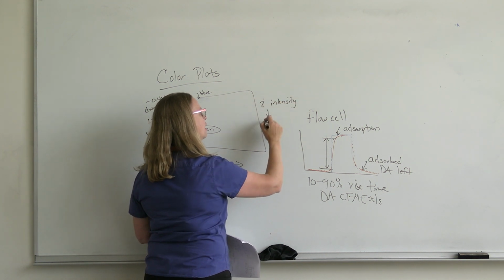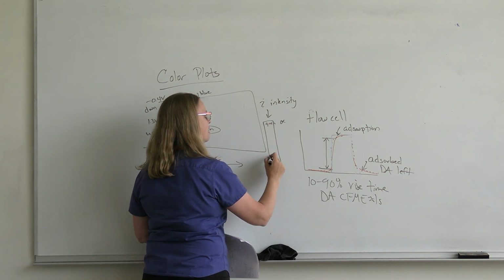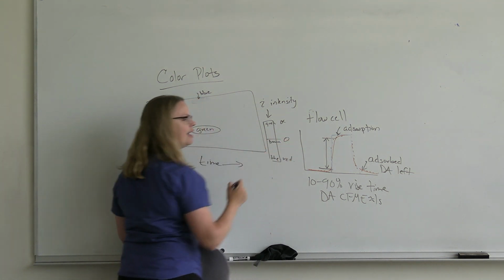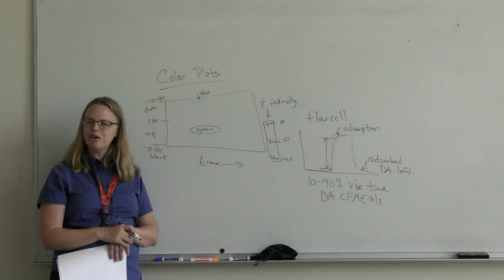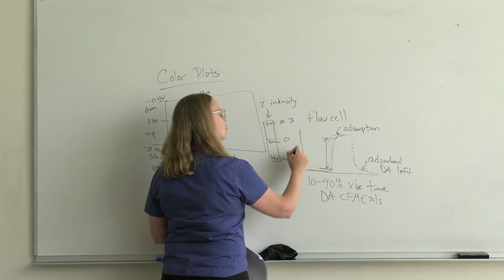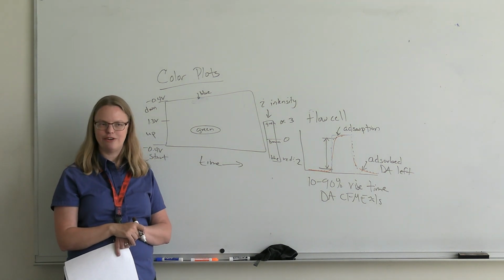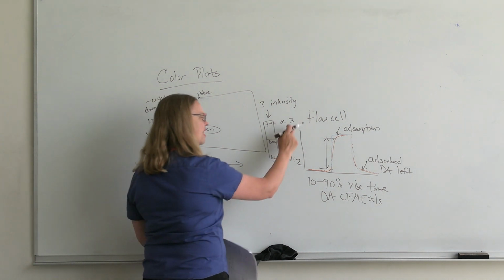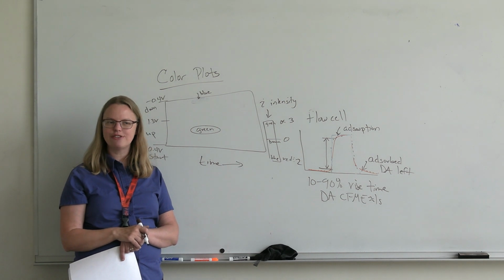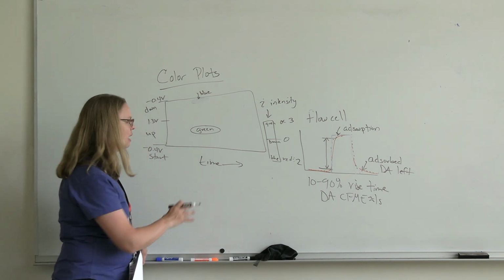In a real color plot, we usually have a scale where we have some sort of green up here, and that's our most intense oxidation. We have blue down here, that's our most intense reduction. Somewhere in the middle it's brown, and that's 0. One thing to notice: I told you the oxidation is always bigger than the reduction. These plots are standard so that this is in a 3:2 ratio. If you put this plot in a different ratio, you get different colors, and they don't look right. So if this is 6, that needs to be 4. Our programs are good about automatically doing that, but if you start to fuss with it, you could get it out of ratio, and if it's out of ratio, it will not look right.